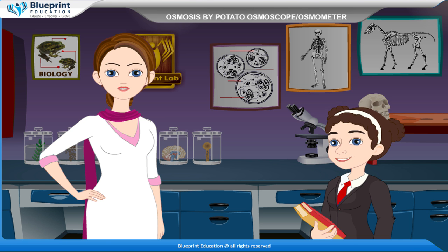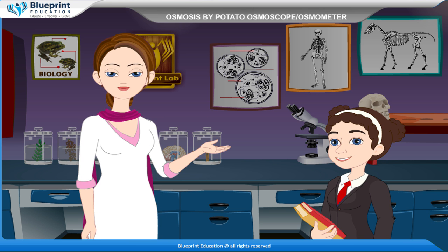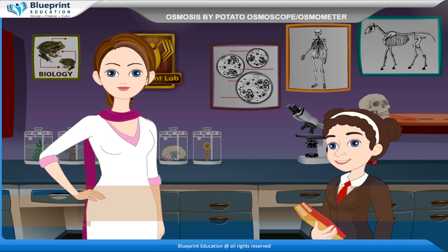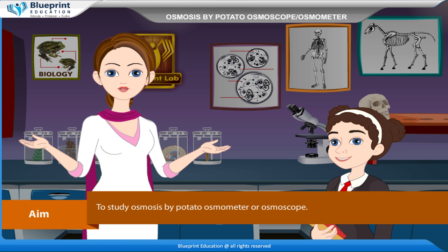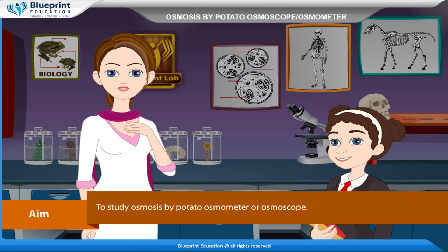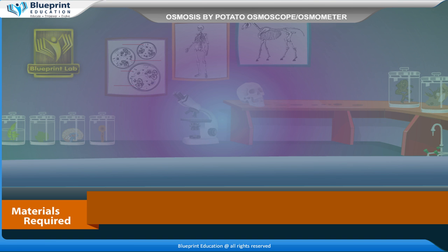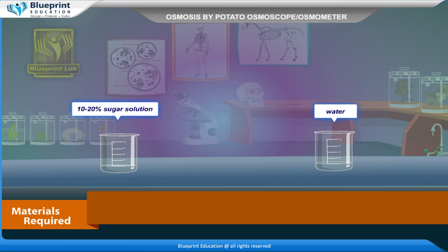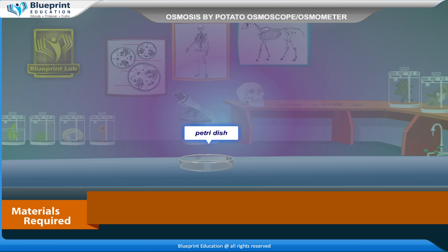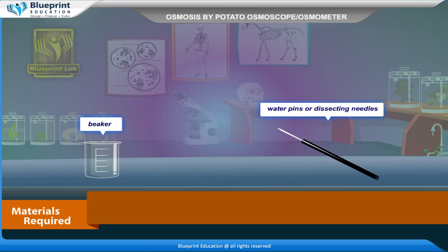Let's do an experiment to study osmosis by potato osmometer or osmoscope. Our aim is to study osmosis by potato osmometer or osmoscope. The materials required are: large potato, potato peeler, 10–20% sugar solution, water, petri dish, beaker, and water pens or dissecting needles.